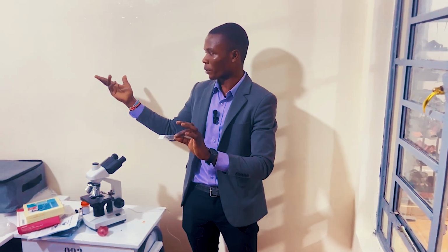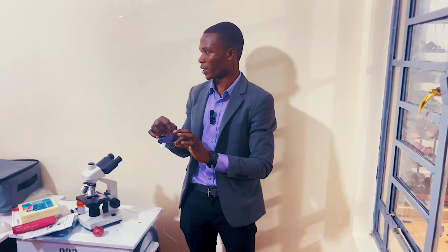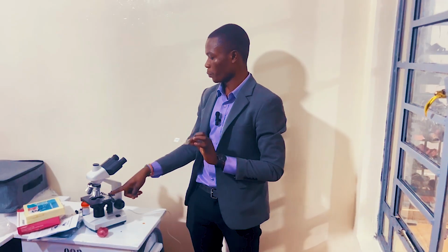So you wipe, or you use a very soft tissue or the serviettes, because those are able to absorb the iodine solution. Are we together? That one, you do it before you put it in the microscope. You do that on your working table.